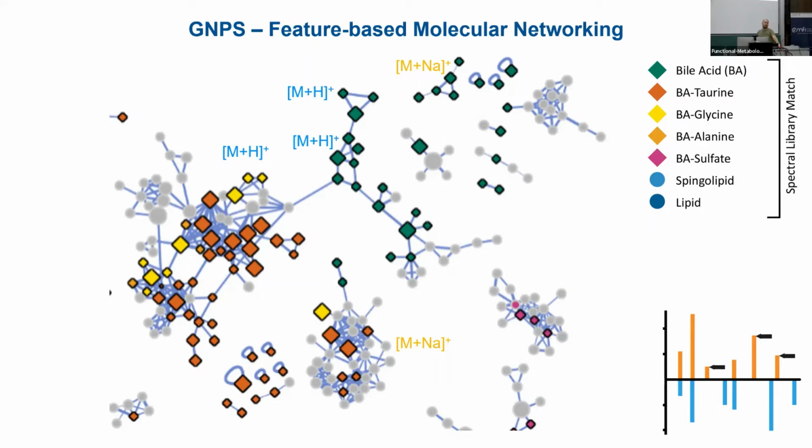Maybe on that note, it's also important to stress that that's also one metric and one way to look at the data. There are more and more new metrics emerging, like spec2vec from Justin and others would be one. Or now MS2DeepScore, or spectral entropy, by the Fiehn Lab. I guess none of them is absolute, but they can be complementary.